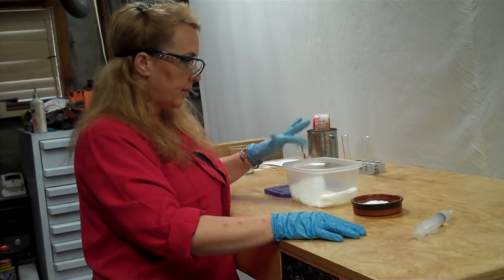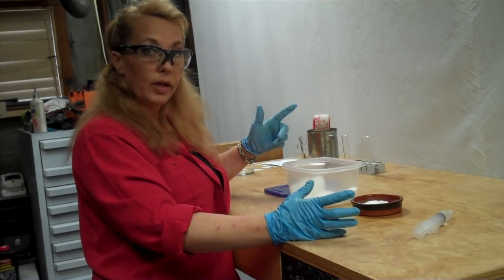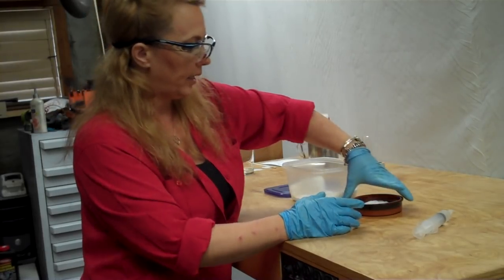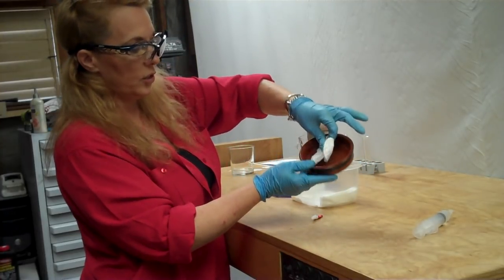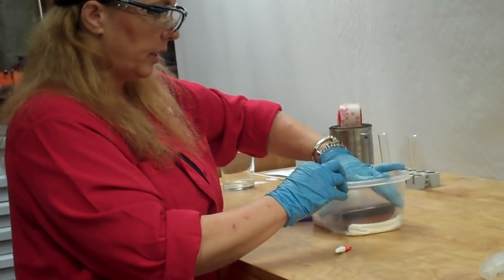So I have a plastic container and I have some paper towel in the bottom that I dampened a little bit with some water to give the container some humidity while it's fuming. And then I have here just a little porcelain dish with about three of those little makeup pads. I have the same ones here and I just want to put those in there.